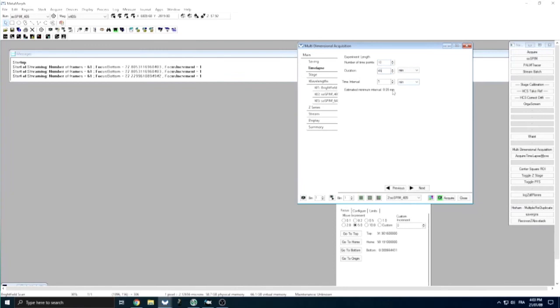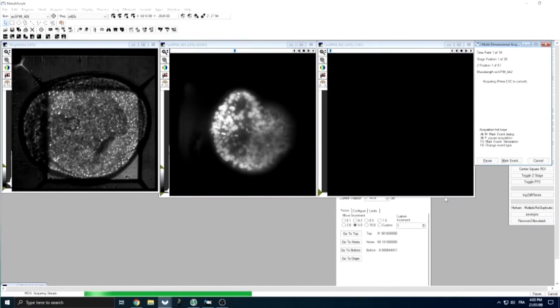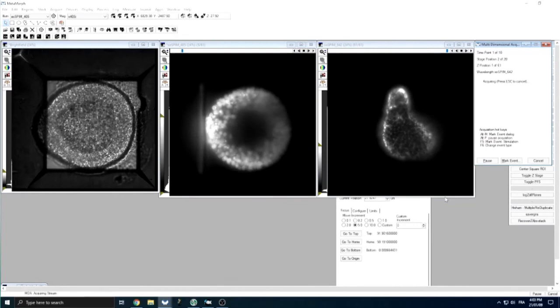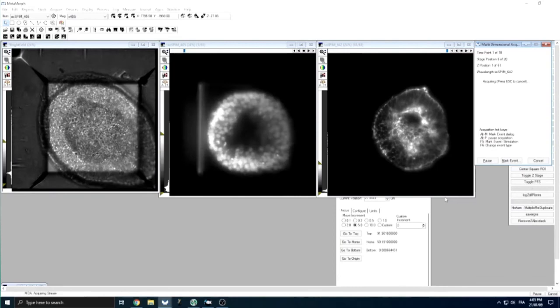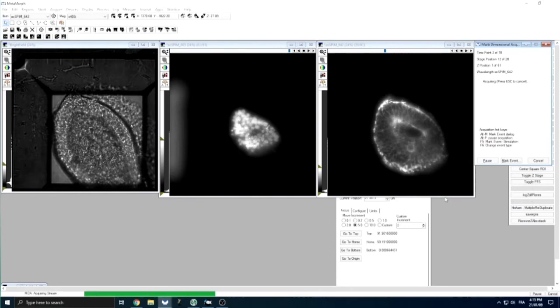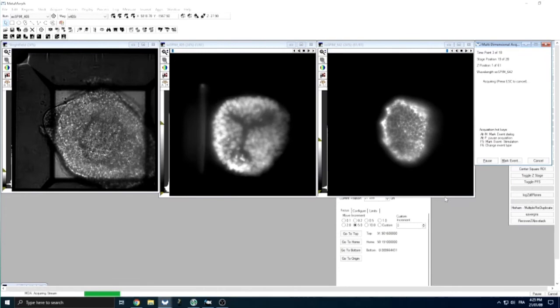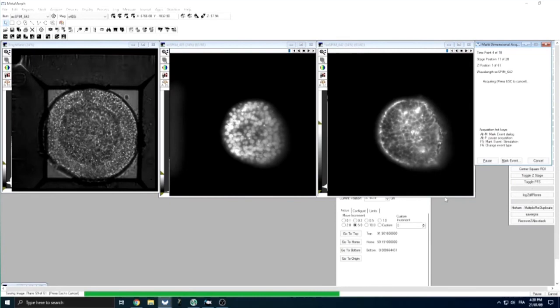We end by checking that the stream option is correctly configured to ensure 3D SOSPIN imaging, and then launch the acquisition process. All stage displacements, stream acquisitions, and data saving are now handled by the MDA tool. We can see that the system is sufficiently stable to allow for optimal 3D imaging on all 20 positions and 10 time points. For longer acquisitions, we developed a repositioning tool based on the high contrast of our G-wells when imaged in brightfield, enabling correction of G-well lateral positions at a user-defined frequency. We demonstrated that this tool enables timelapse acquisitions of up to 40 hours without any noticeable deterioration of the 3D imaging quality.